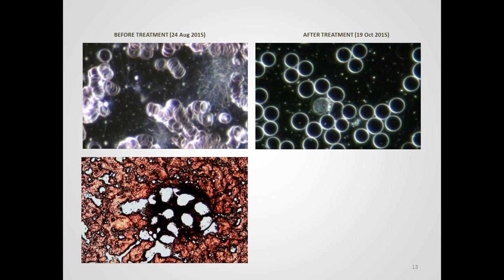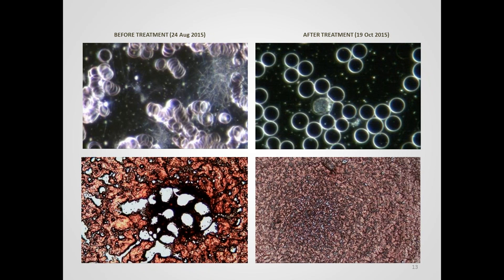Right, and the last image here is actually from the dry blood test. It's one of the dry blood samples, and we're seeing large white round patterns towards the center of the sample. This is called a bowel pattern, and this is really typical of any major bowel challenges, especially when there's inflammation in those areas, and really a dramatic degree of improvement here in the follow-up visit.